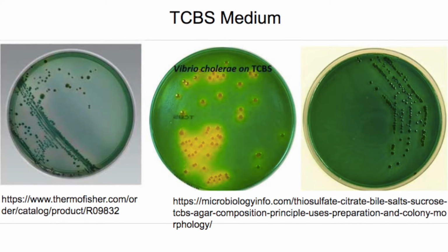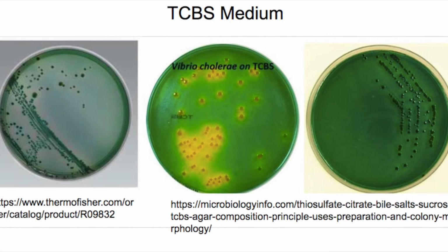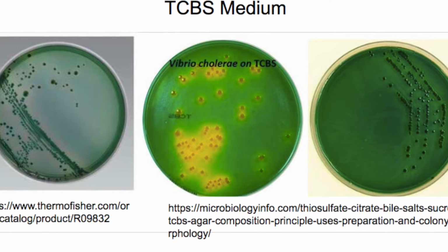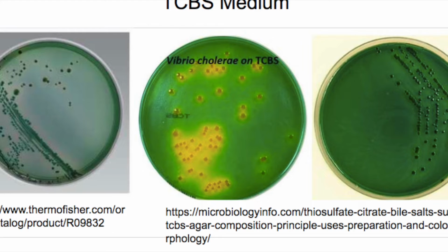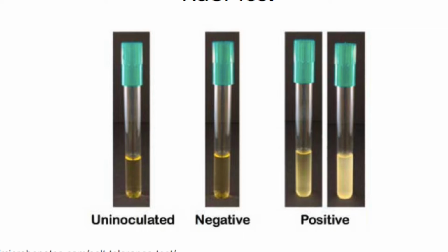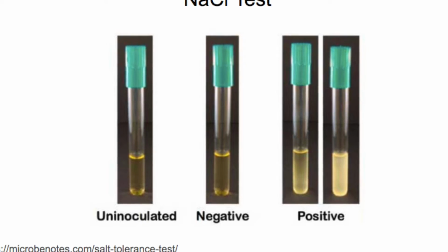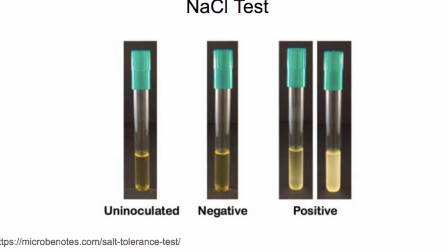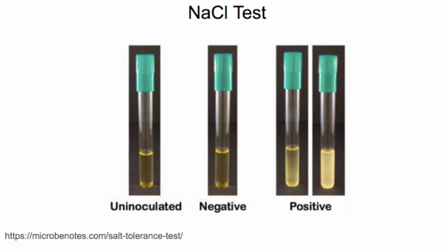Certain Vibrio bacteria ferment sucrose while in TCBS, which would be indicated by a yellow color. The result came back green, which showed no fermentation of sucrose. This is in line with the bacteria Vibrio vulnificus and Vibrio parahaemolyticus. In order to differentiate between the Vibrio species, plenty of tests were run. Growth in broth with NaCl and without NaCl. For broth without NaCl, the results came back negative, while the broth with NaCl came back positive, which indicated the bacteria needed sodium in order to grow.